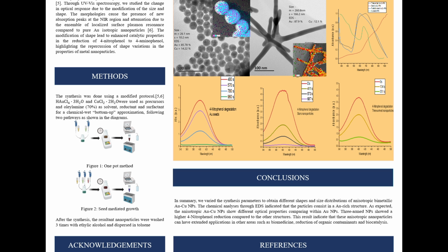The other pathway was made by seed-mediated growth, in which we also mixed the precursors and oleylamine, but added gold seeds.